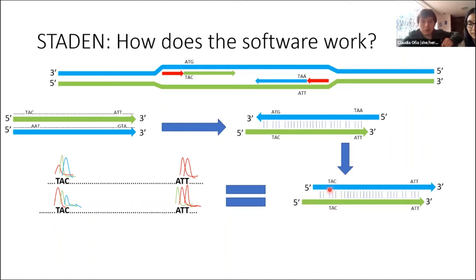What we gain with this process is a duplication of the information, but obtained with two different sequencing reactions. So we can double check if the base calling of a sequence is correct or not. For example, if here is a peak of C that is very low, and we're not quite sure that the base calling algorithm got it right, we can double check in this other sequence, and we can see that it was not a mistake. It probably was a low, weak peak, and that's it. And we're going to see how this is very useful, because as I've said, the base calling algorithm usually makes a lot of mistakes, and the raw sequence that you get in the PDF files or in the AB files is not always the right one.